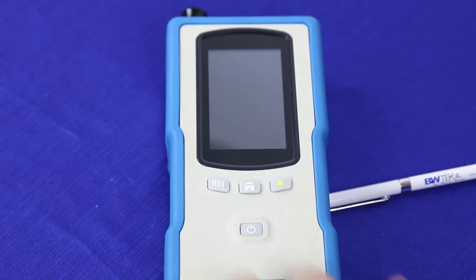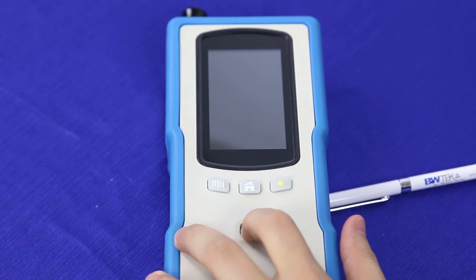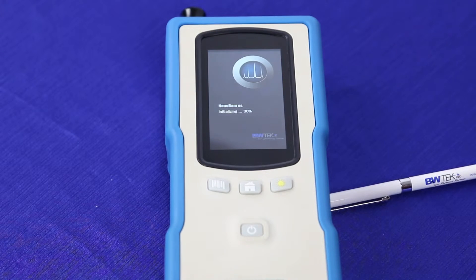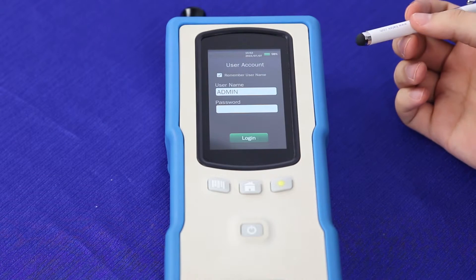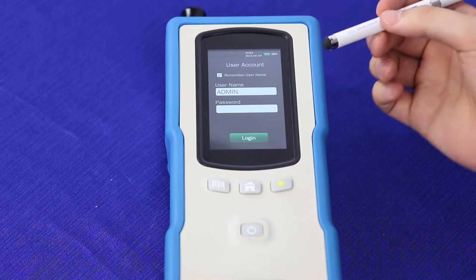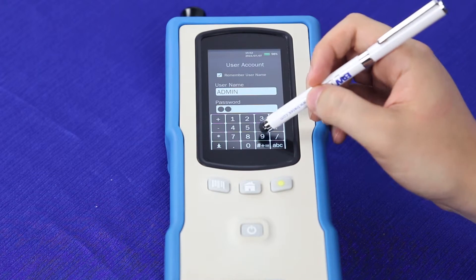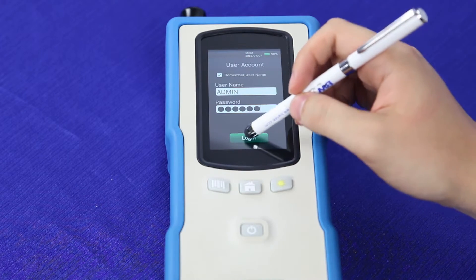To power on the NanoRam, press and hold the power button for around three seconds. This will bring up the initial screen, followed by a percentage completion indicator, and then you will get to the user login screen. The first time you start up the instrument, you'll want to log in as admin and type in the password 999999.